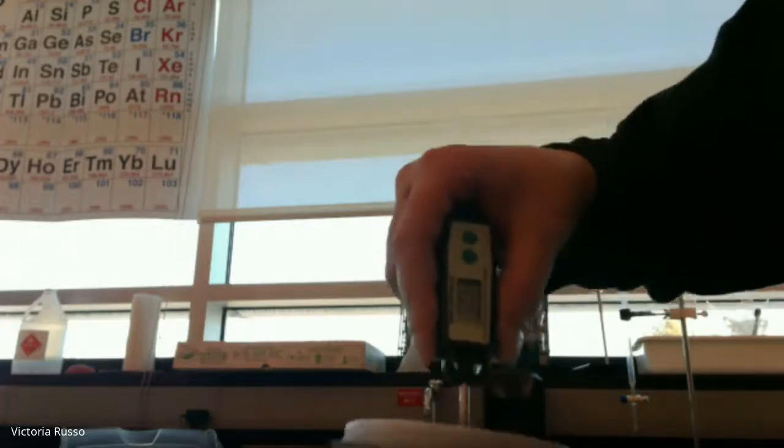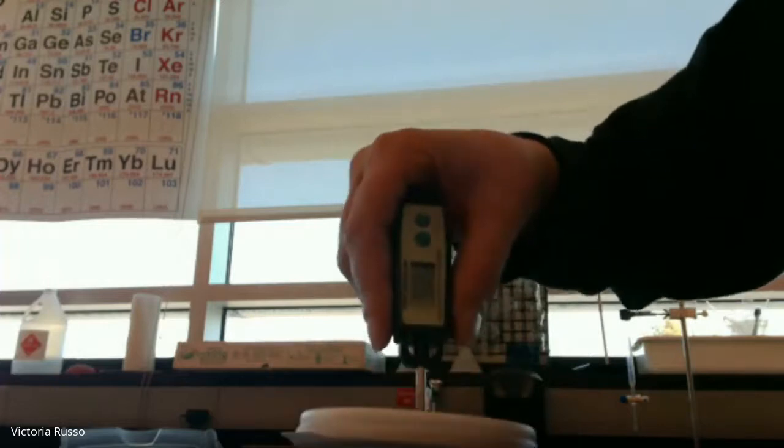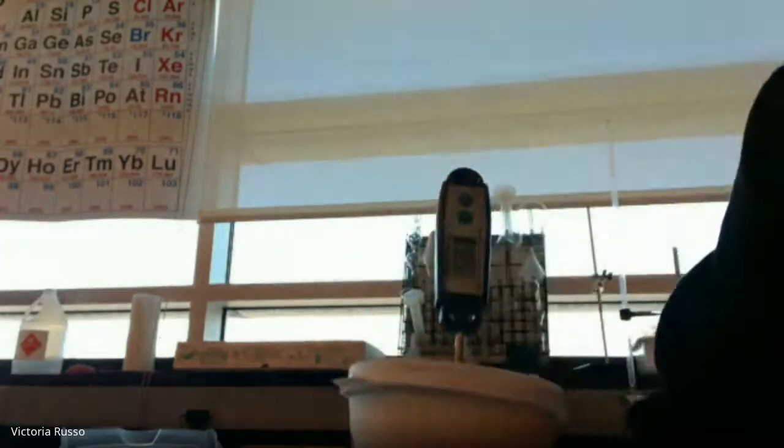51, so it's really still occurring. I think it just took a while to get started. 55, it's getting really warm to the touch now. 60, 62, oh, the reaction is occurring. All right, it's starting to go down now. So the highest I saw it reach was 60, looks like 61.4 was the highest I saw it reach. And I hear the bubbling has stopped. So the final temperature was 61.4.